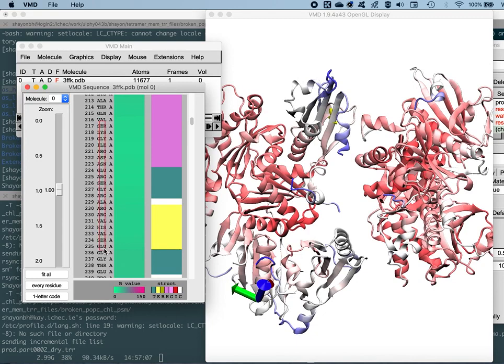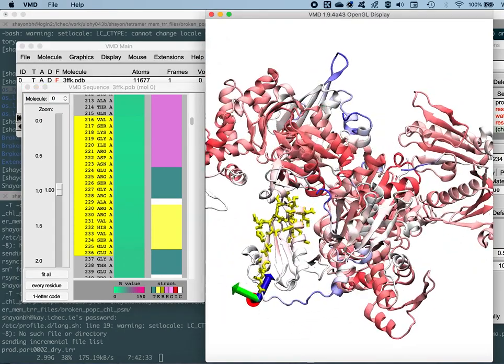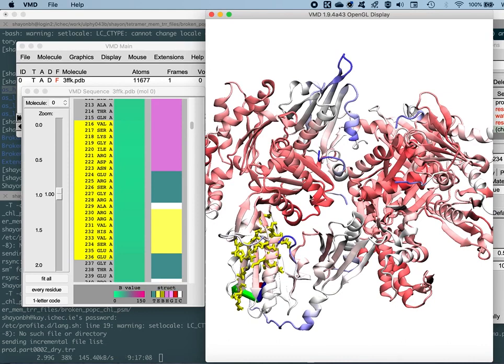So you just left click and drag along, and it will select the number of residues. Okay, not bad. So this is lying somewhere around this region. After all, this was not a very light shade as we have expected. So guessing by the shades of red out here, imagining still a lighter shade of green would be available to a region corresponding to this out here, which is darker in shade.